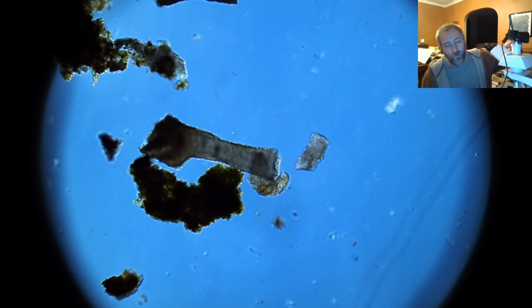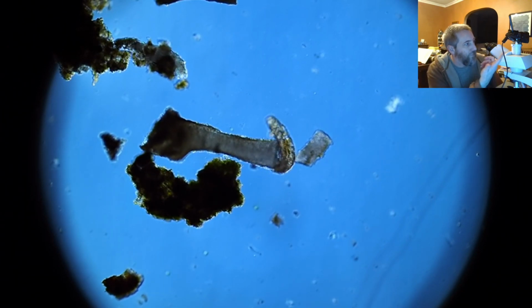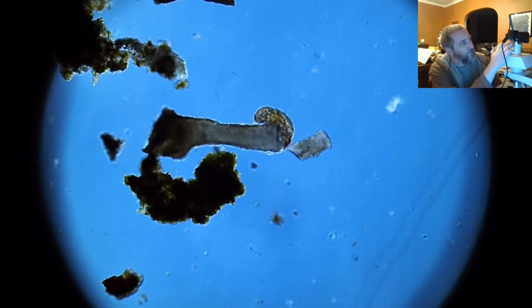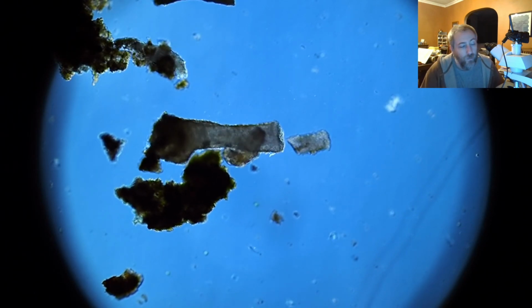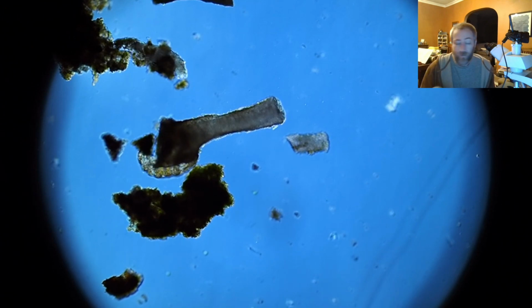And you can see that I have a little C-mount adapter that hooks it up to the microscope. It's just a little piece of metal that basically screws in, and then the image comes straight from the objective up through this trinocular mount into a little lens and a camera adapter. And that camera adapter is actually designed to fit the Leica digital camera that comes with this Leica microscope when you buy it.